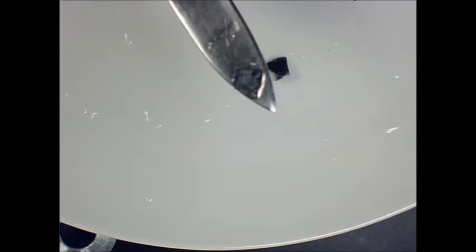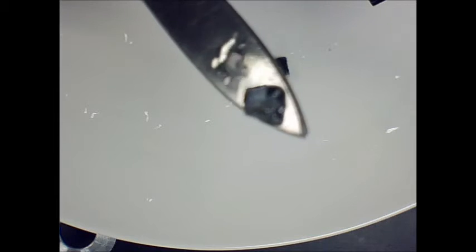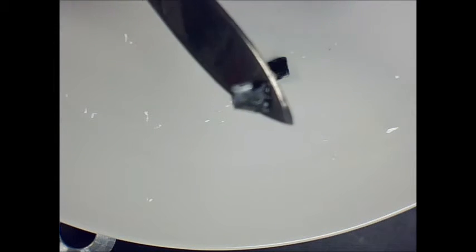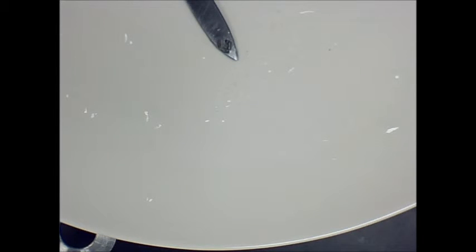And you see the inside there is shiny. And it's already beginning to oxidize a little bit. If you look carefully, you can see it starting to turn a little gray already. That's how fast it reacts with oxygen in the air, even with the oil that's coating the outside.